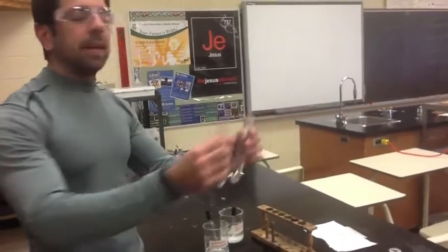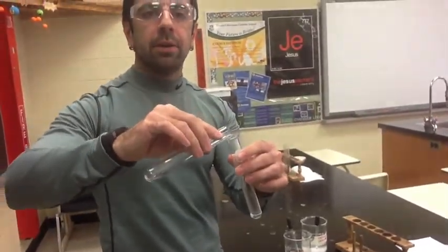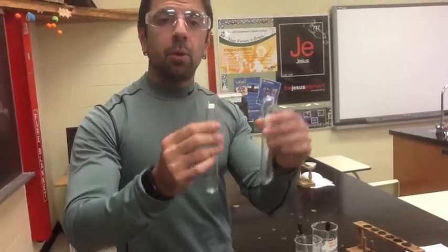Once you have done that, take either one of the 2 test tubes, pour one into the other, let it sit for a while, and stir it up a little bit. Again, goggles on, and make your observations as to what type of reaction has taken place. And how do you know that a reaction has taken place, if a reaction does in fact take place?